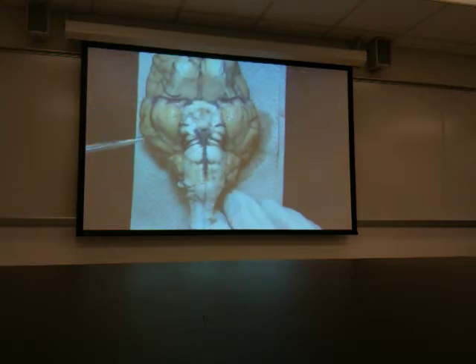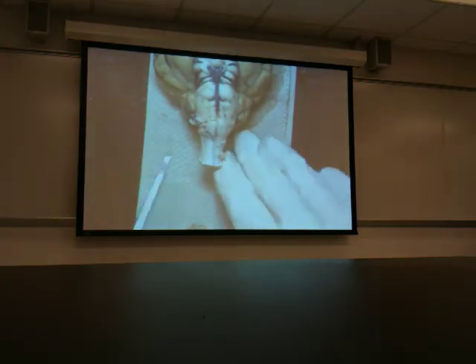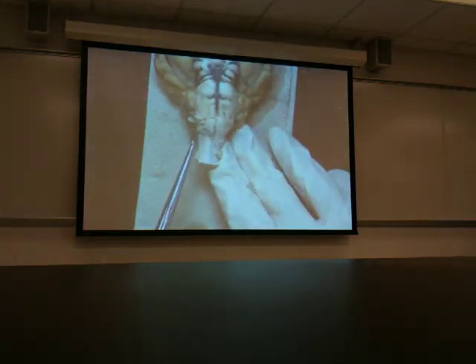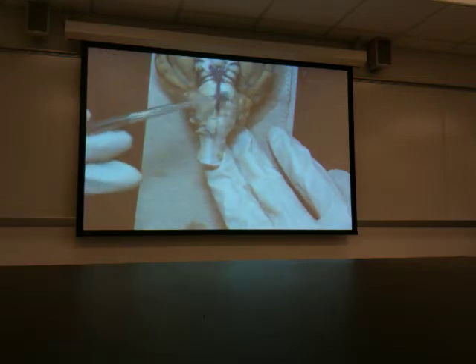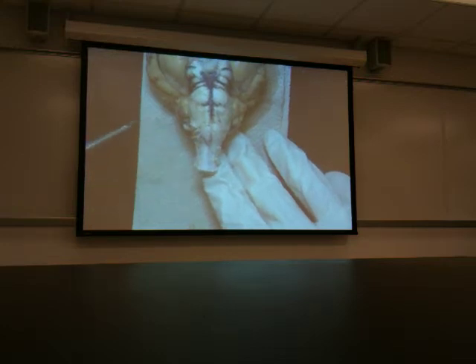Okay, and what we have for structures here, oh my gosh, there's really nice roots of the hypoglossal nerve. Look at that, the first time you will have seen it so nicely. Those are the roots of the hypoglossal nerve. Can you see them? Okay, so what we have behind the pons here is we have the medulla oblongata, as you can see. And this is the spinal cord. But here are the roots of the hypoglossal nerve. You may see those roots on this brain for the test.